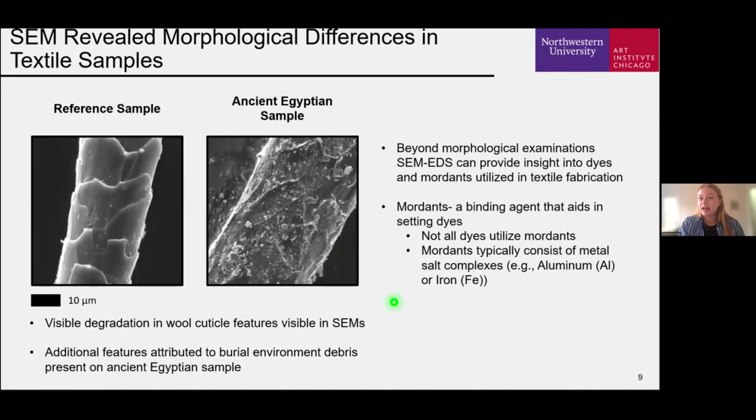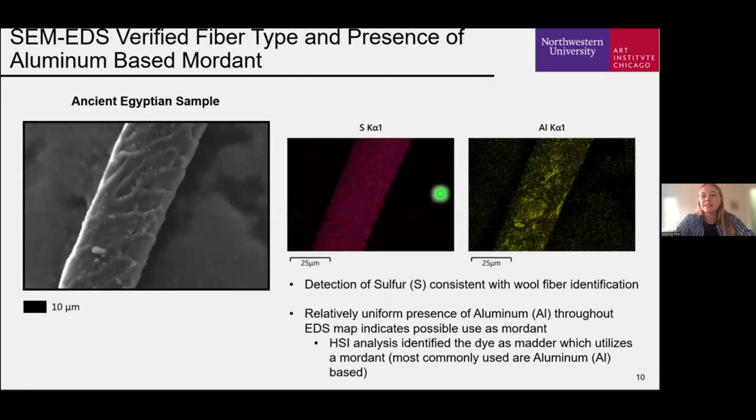Beyond morphological examinations and characterizations by SEM, energy dispersive X-ray spectroscopy can provide insight into dyes and mordants present in the samples. Mordants, or binding agents, were specifically of interest with EDS in the examination of these samples, as XRF analysis was unable to verify the presence and distribution of lighter elements of commonly used mordants such as aluminum-based salts.